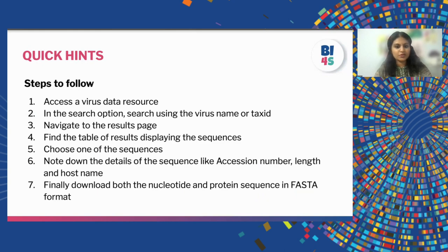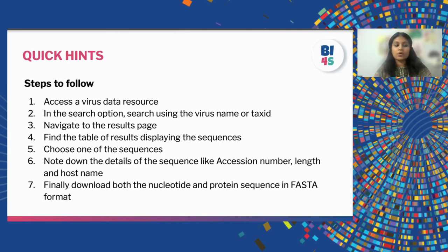Then we are going to navigate through the results page. Once we reach the results page, we are going to choose one of the sequences, because monkeypox virus will have a lot of sequences. We can choose one of the listed sequences provided in the results table. Once we choose our sequence, we are going to note a few details: the accession number, the length of the sequence, and the host name. Once done with all this, we are going to download the sequence of the virus.